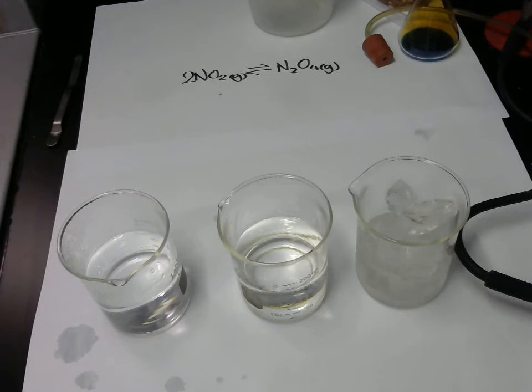I don't reckon it's very observable, to be honest. It is what's happening. Yeah, very good. So I pull it out, it's lighter, and then only a tad darker, eh? Okay, so the pressure one's very hard to show. What's a lot easier to show, now for this I'm going to have to hold the pressure the same, so I'm not allowed to let the syringe move.